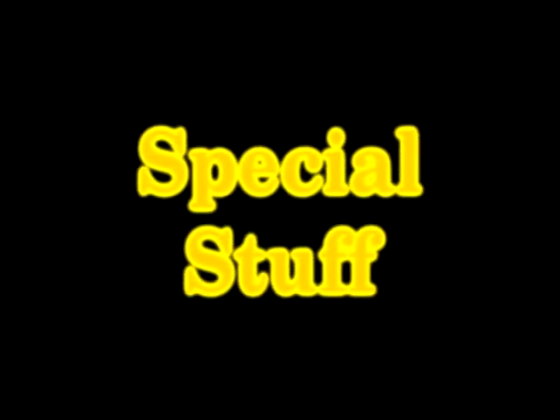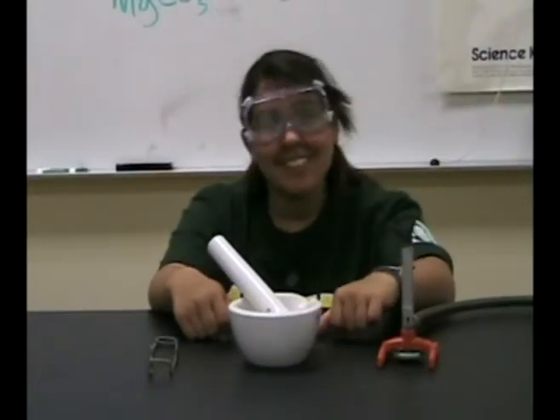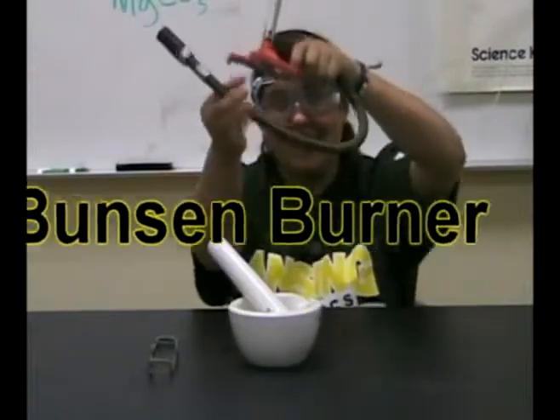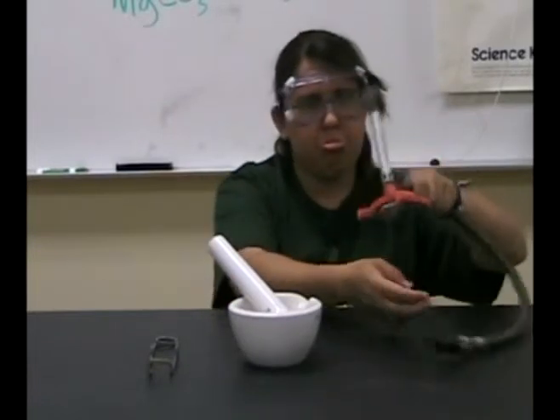Now, on to the specialized items. These items have a specific purpose that only they can do. Bunsen burner. He should only be used for heating solutions. No burning paper or anything else.